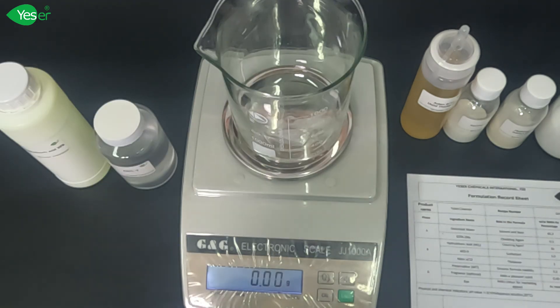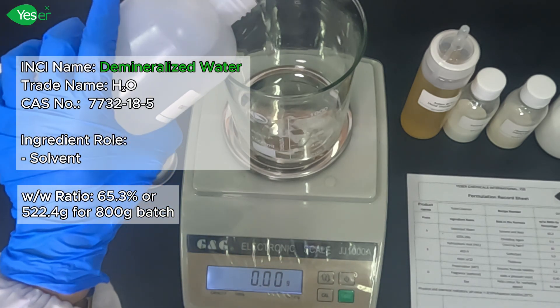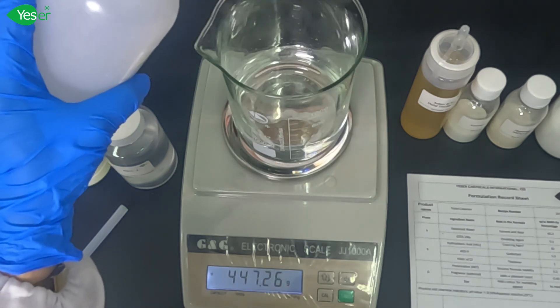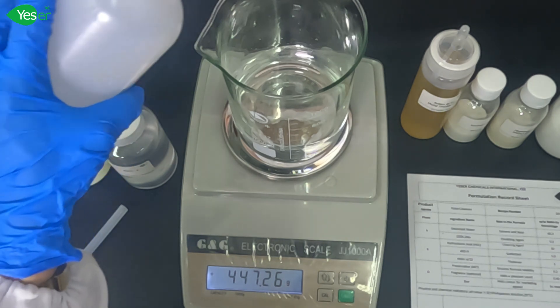First, let's add our deionized water. Weigh 522.4 grams of deionized water in our formula. We will make an 800 gram batch for this formula, and we will divide it into 4 for our 4 different thickeners.